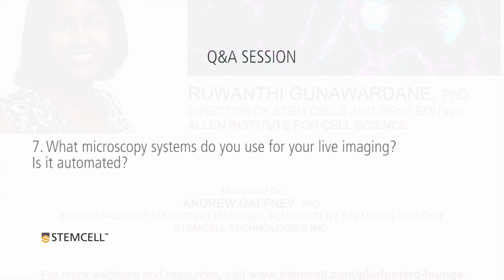Okay, thank you. And along the same lines, what microscopy system do you use for your live imaging? Is it automated? Yes, so it's not automated in a truly automated fashion. Some aspects of it are automated, and that's what the microscopy group is working on right now. Most of it is currently manual, and we're using the Xi system.